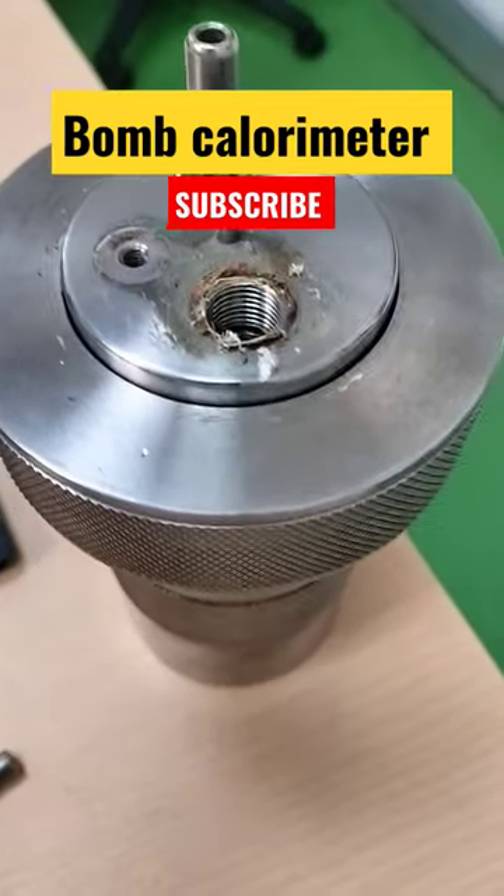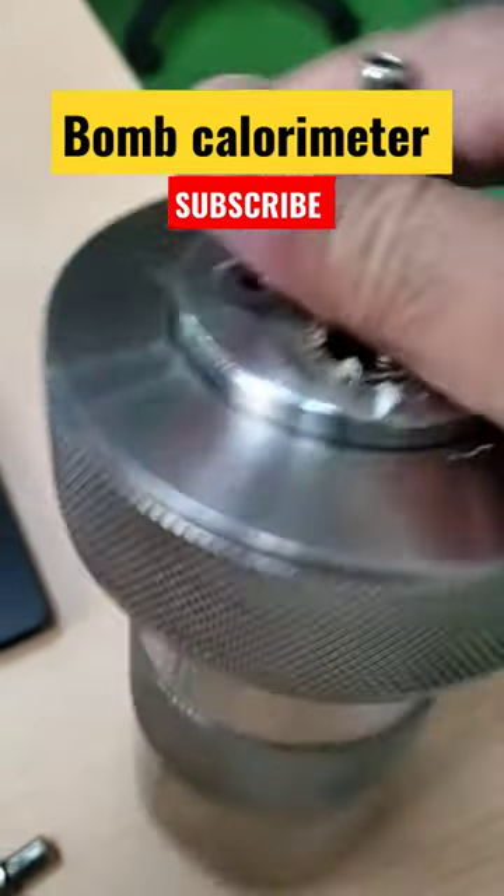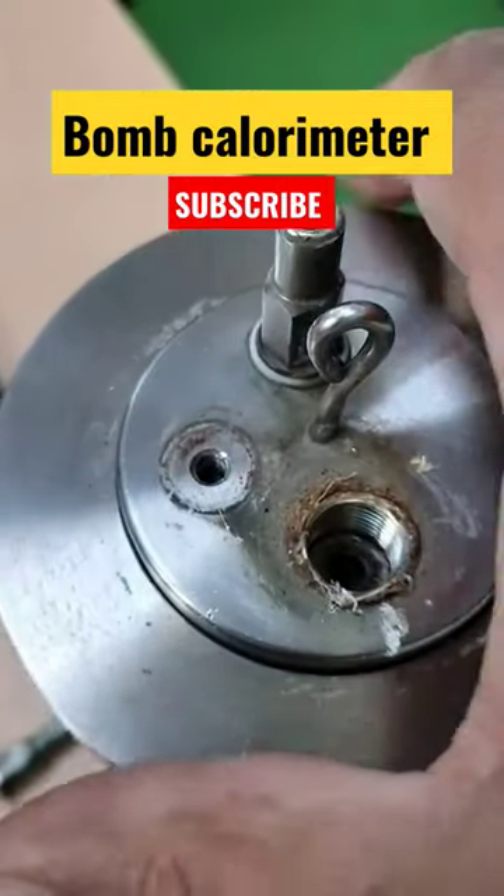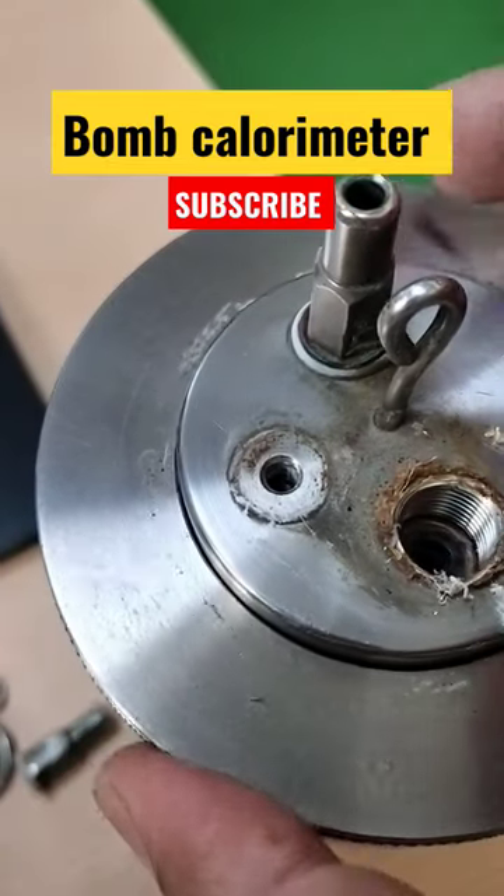This is a Bomb calorimeter — let me introduce this instrument. A Bomb calorimeter measures the amount of heat generated when matter is burnt in a sealed chamber in an atmosphere of pure oxygen gas.